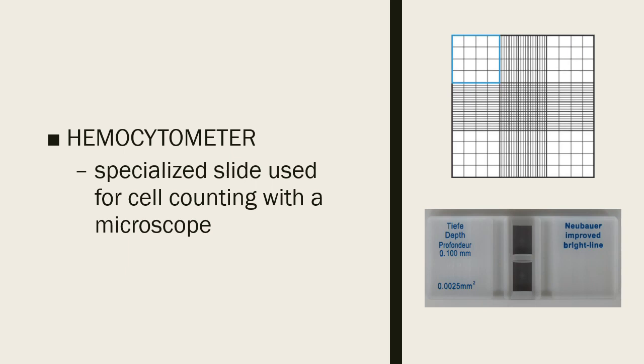And so as for cell counting in clinical microscopy, cell counting is done when you do your sperm analysis, to give you a sperm count. Also, when you perform your cell count and differential count of your other body fluids, for example, you have a turbid CSF, and so you are required to do a cell count. And so you're going to count the cells present. Other than that, your other body fluids, for example, your synovial fluid, and so you need to do such.